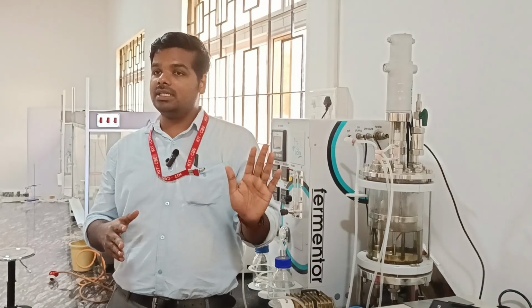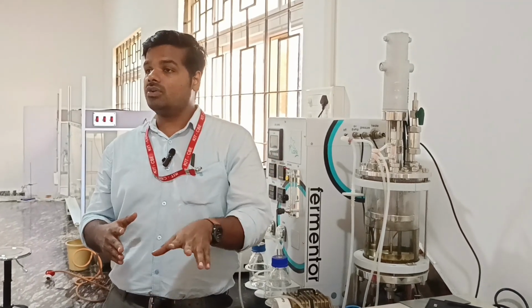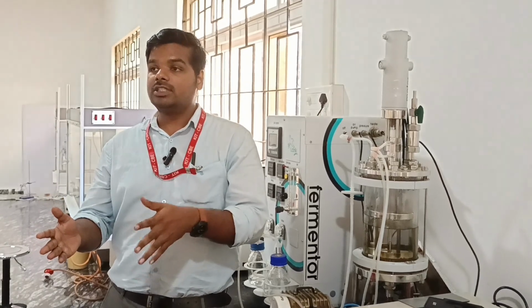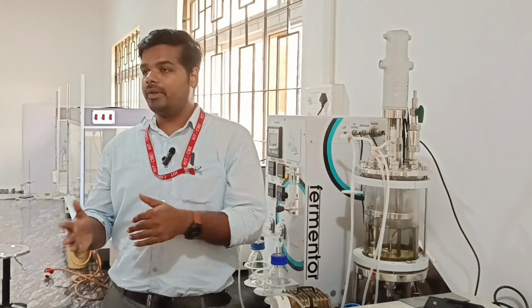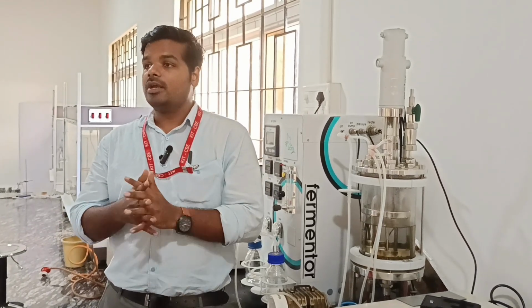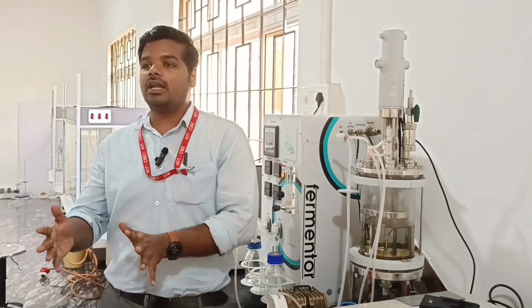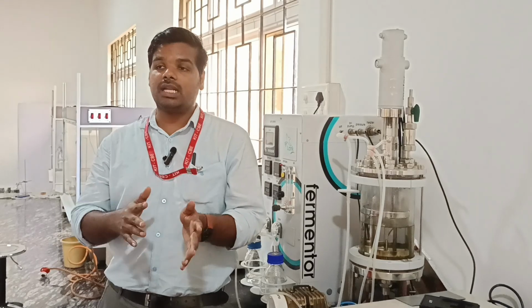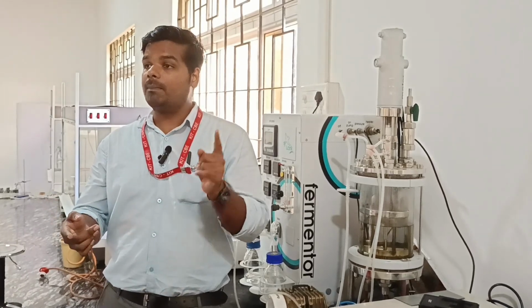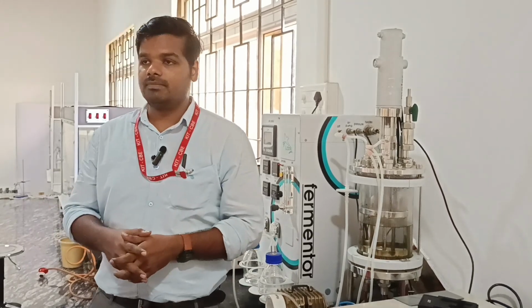The activation energy and the Arrhenius constant of that particular bacteria were previously determined in our previous experiment. Geobacillus stearothermophilus is the model microorganism that we are using. For that microorganism, we first need to define the Arrhenius constant and the activation energy from the thermal death rate kinetics.